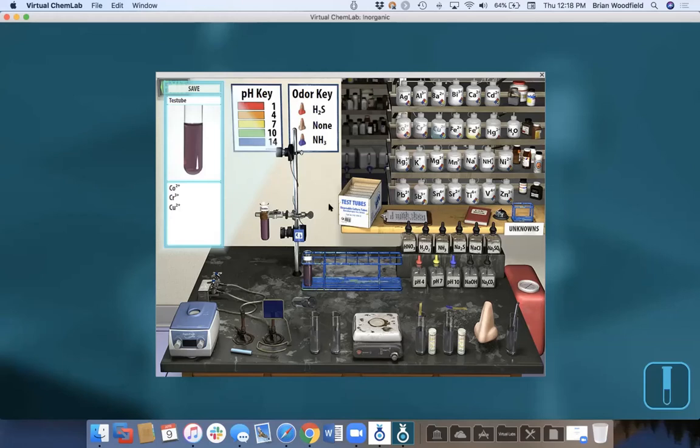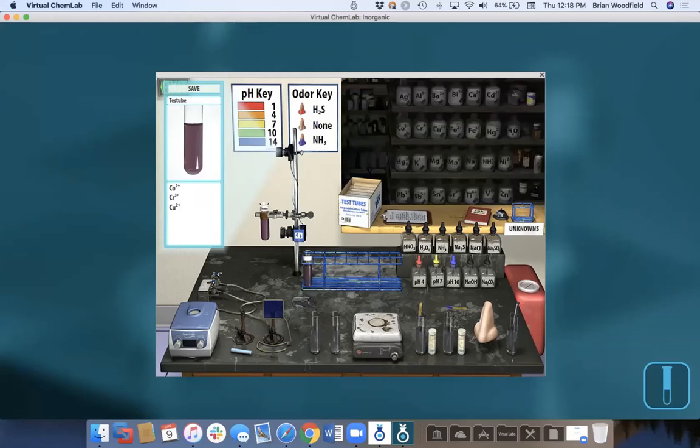So this is how, for example, we would do this. I could say, what happens at pH 4? Or what happens if I go to pH 7? Or pH 10? And then I can show that all of these things are forming precipitates. There's their current state. So these are real chemical states. Like you may say nitrates are soluble, but cobalt forms a weird nitrate precipitate with hydroxide. We did this. We determined that spectroscopically.